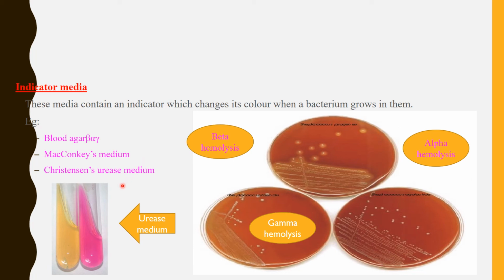Third one is Christensen urease medium. Christensen urease medium is used to check the urease activity, like for Proteus mirabilis.